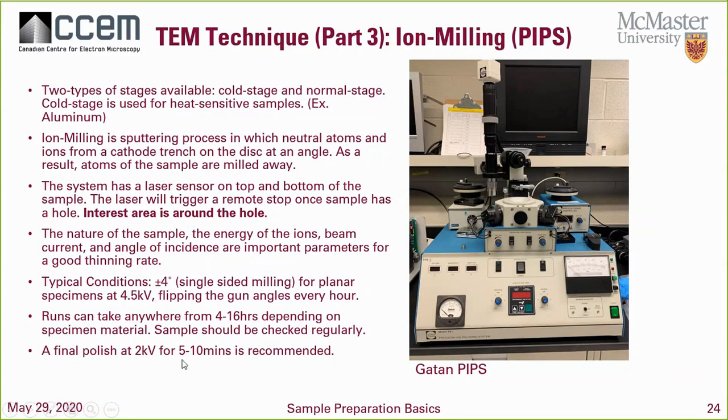And I recommend a final polishing or final milling step at a very low kV, targeting the same area, maybe switching your angles a little bit to something lower, or if you want to target the middle a little bit more. For maybe 5 to 10 minutes, recommended.